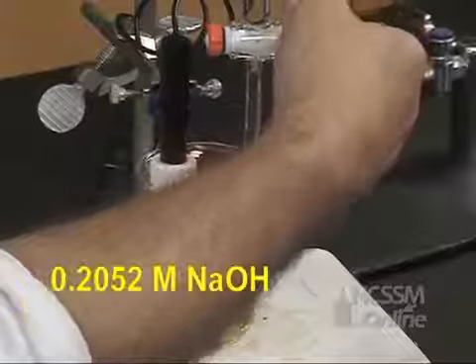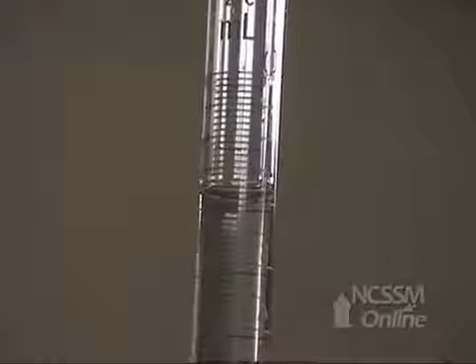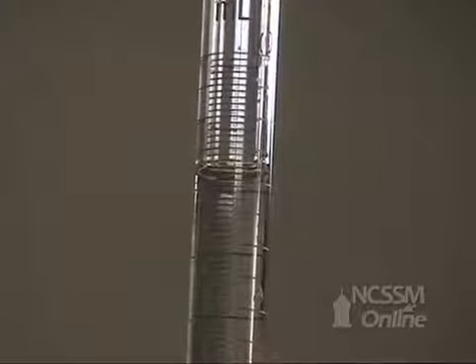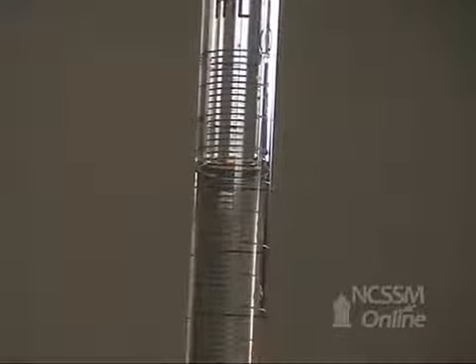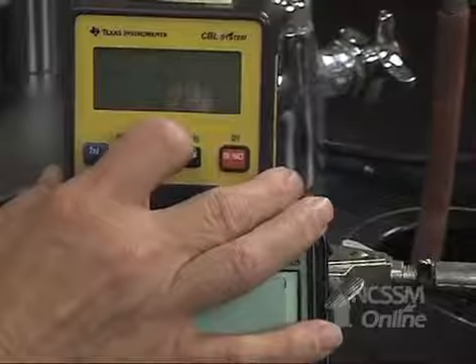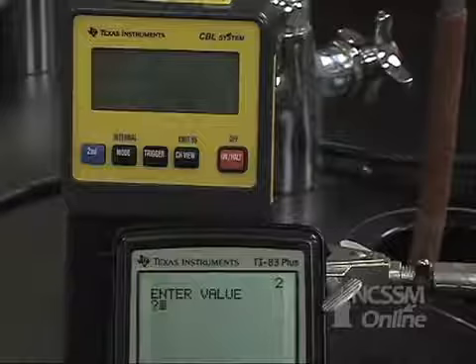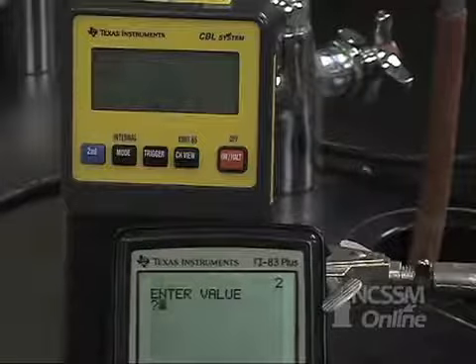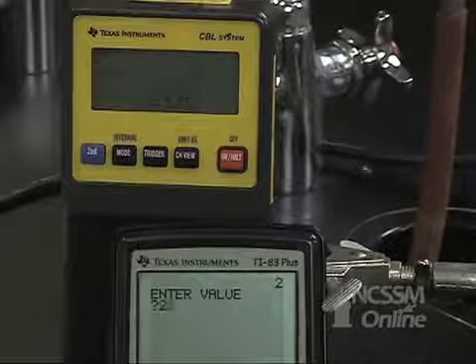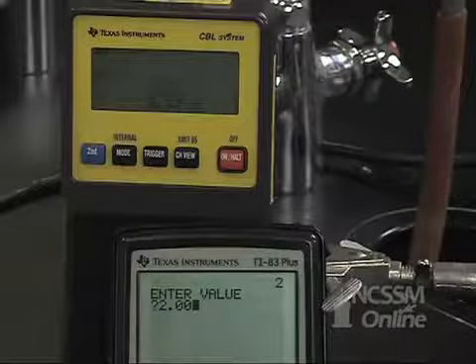We're going to carefully add 2 milliliters of NaOH solution. If you don't reach 2 milliliters exactly, just read the volume carefully off the burette and enter it to the nearest hundredth of a milliliter. When the CBL reading is stable, press trigger on the CBL and enter the volume on the calculator, in this case 2.00. Again, collect more data.